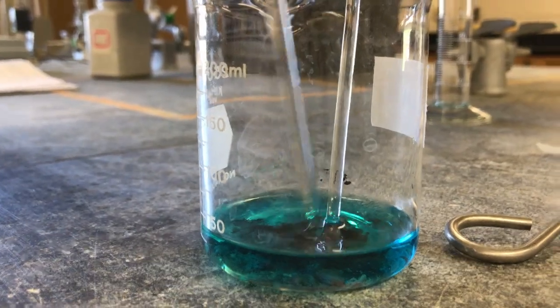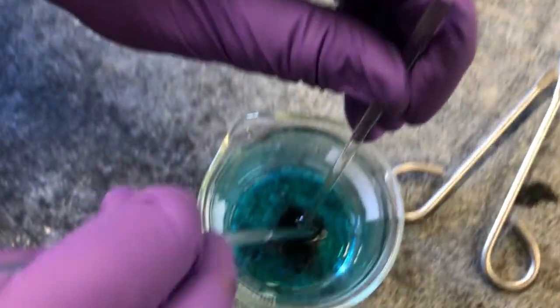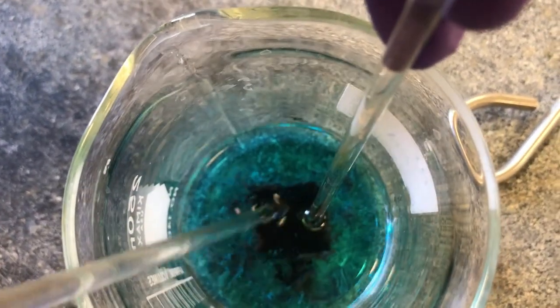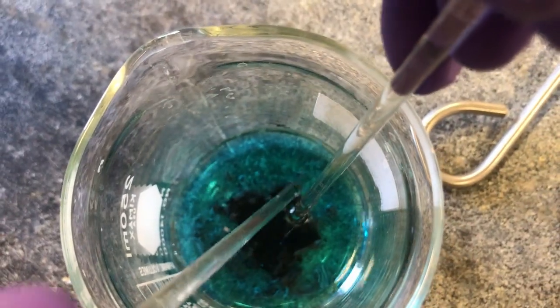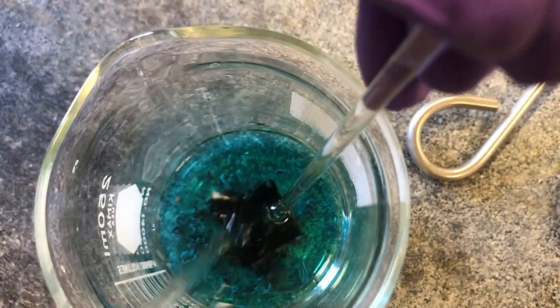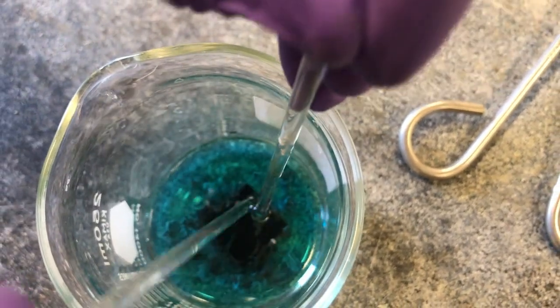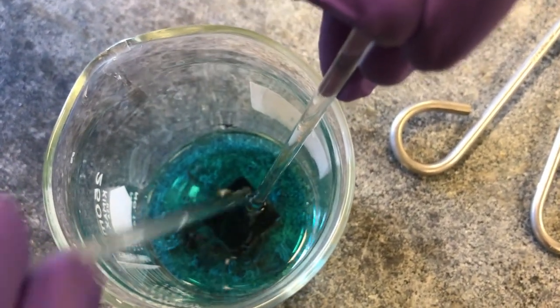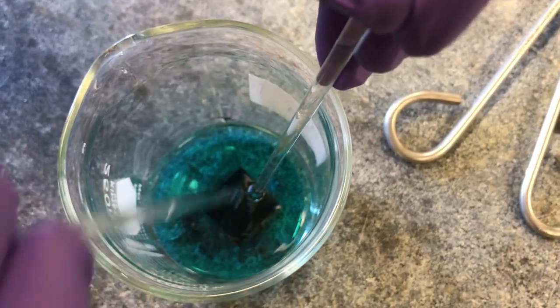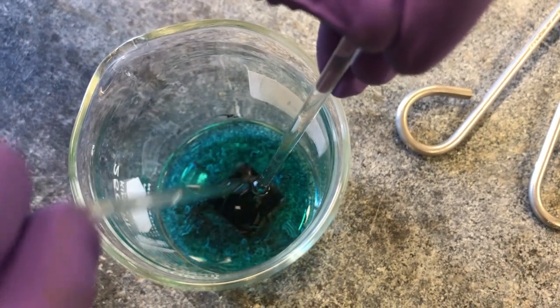And Corey, you want to have a top view? Yeah, let's do a top view. So if you notice, you see scratches are appearing and they're quickly going away. That is the copper chloride quickly reacting with the zinc surface. So we're just going to keep on scratching, and if the scratches stay on the surface, we know that all of the copper chloride has reacted with the zinc metal.